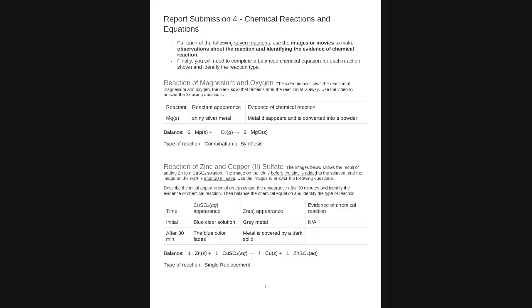You saw a lot of heat, a lot of light also. And the reason is that when the magnesium oxide forms, this reaction produces a lot of heat. And they mention it at some point, don't look at that light, because when the magnesium becomes very hot, it's going to emit light, and the visible light is okay, but it's going to emit also UV light that is not good for our eyes.